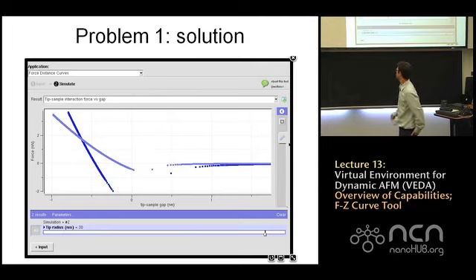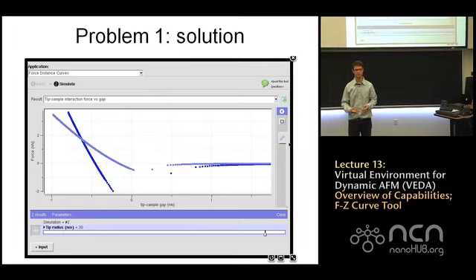There's two effects that happen here. One is that the adhesion force goes up for the tip being 30 nanometers because now the van der Waals forces are acting on a larger tip radius. The other effect is that it stiffens the interaction. The tip is bigger and it's compressing more material when it interacts with the sample, so effectively it looks stiffer.